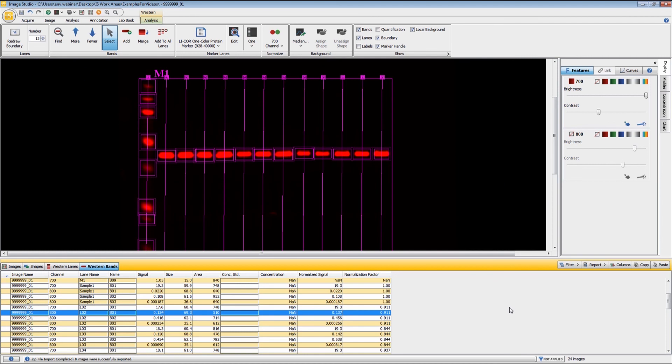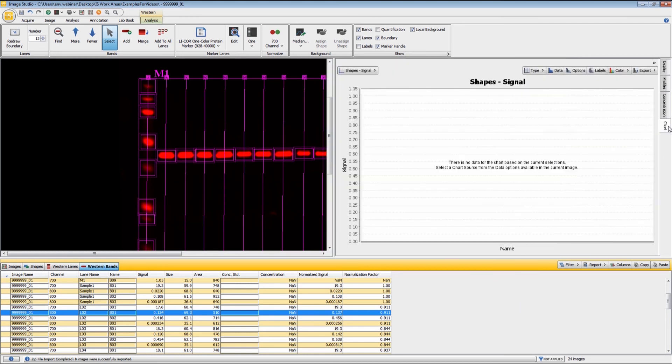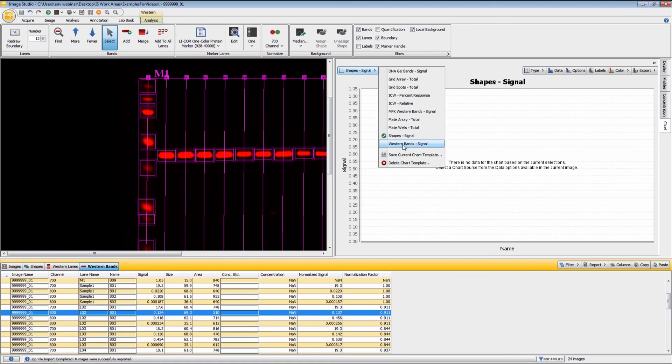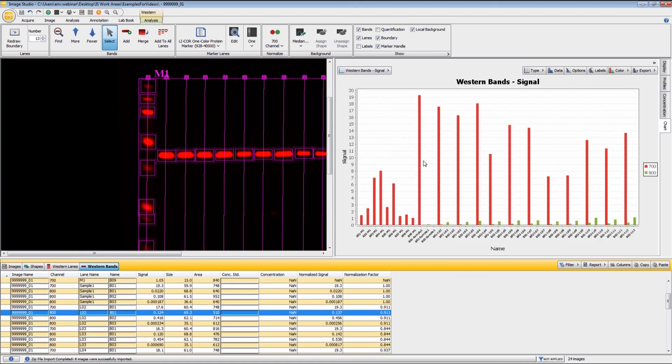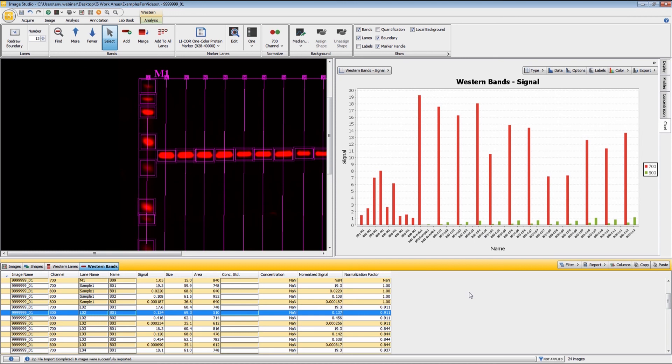If you would like to view these data within a chart, I can come over here to the chart tab just to the right here on the screen, and I want to choose a Western bands table just like that. And so we have a charting of the entire data set, both the 700 and 800. If you would like any further information on the Western analysis, that can be found in the Help section. Thank you very much.